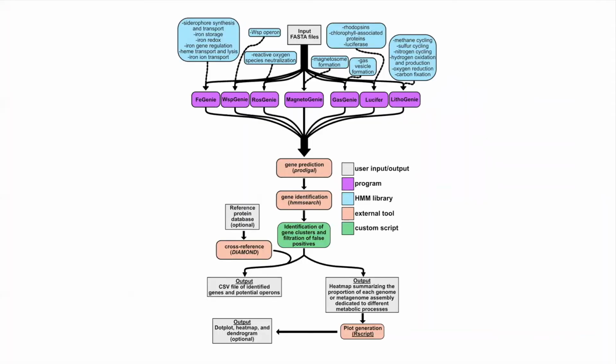Right. So this is now getting into something that I like to call the magic lamp part of this presentation. Magic lamp isn't really a published tool yet. It's a pre-existing scaffold, and that scaffold came from Genie. And Genie, as I discussed in lesson 4, is essentially an HMM library of all iron-related genes.